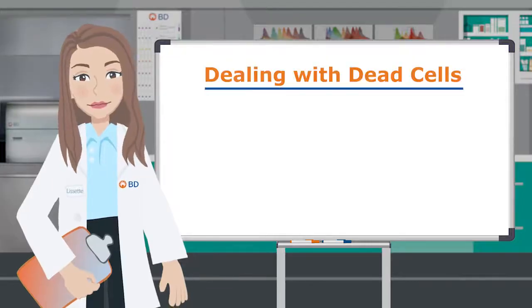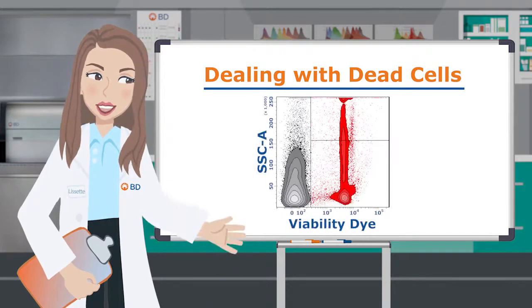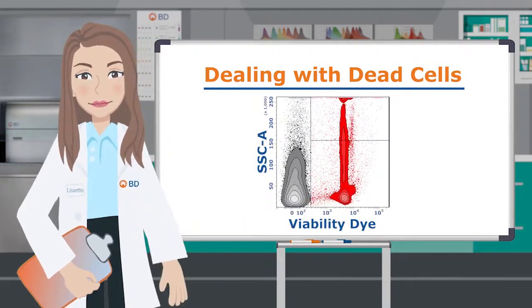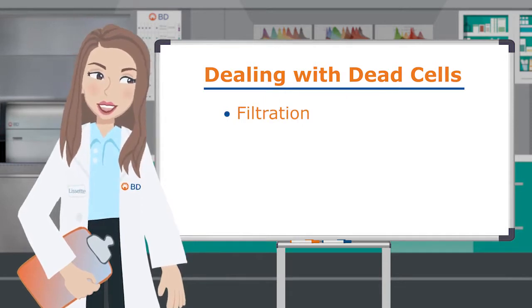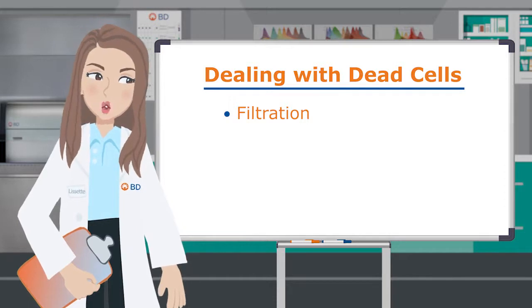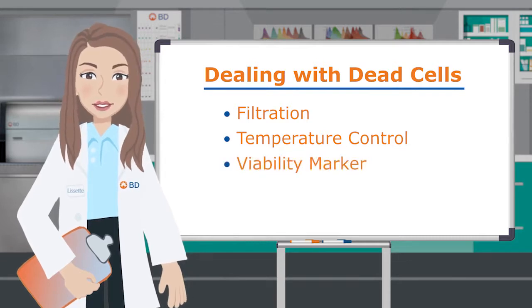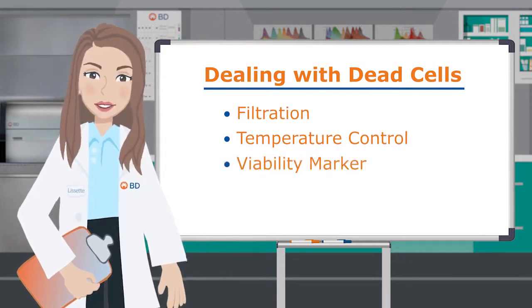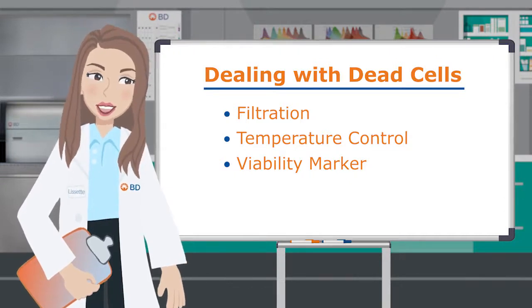Frozen and cultured cells, as well as tissue-derived cells, often have many dead cells. These unwanted visitors can be successfully dealt with. First, filtration with a cell strainer can remove clumping cells that can lead to high background staining or clogging of your cytometer. Further cell death can be prevented by maintaining cells at the appropriate temperature. Finally, a viability marker can help resolve live cells. Since dead cells tend to demonstrate unusual autofluorescence and non-specific staining, using a viability marker to gate them out can improve your analysis.